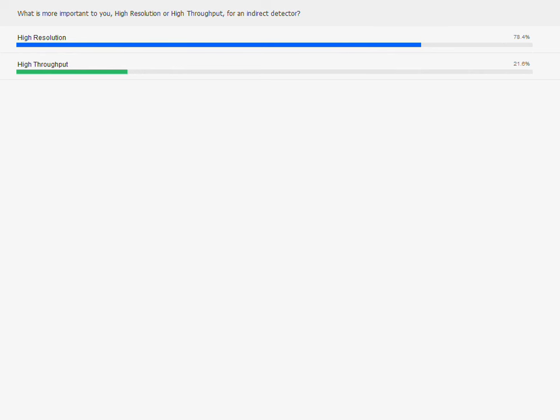Okay, so high resolution, which, considering the title of the presentation, should not be too much of a surprise. Now we've talked about scintillators and we've talked about the camera. I'd like to hand back to Yuri, and we'll see some real-world work that we've done using our detector and the scintillators from Crytur. If I can pass to you, Yuri.